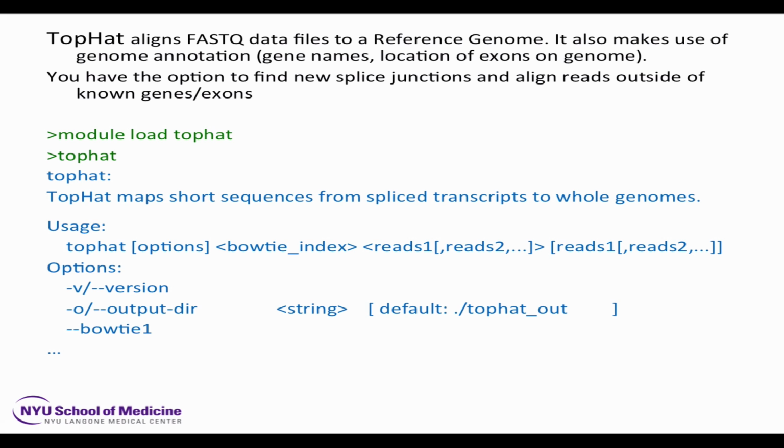If you had run a paired end, you could load both pairs at the same time. And TopHat actually gains some power of mapping when it knows that two reads are near each other. Sometimes it can distinguish a read that's repetitive at one end, but matches to a unique portion of the genome in the other end. And then that's it. And then you would hit return.